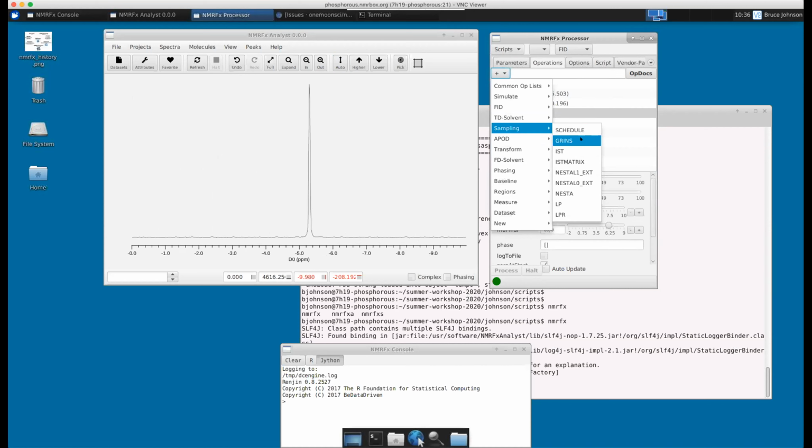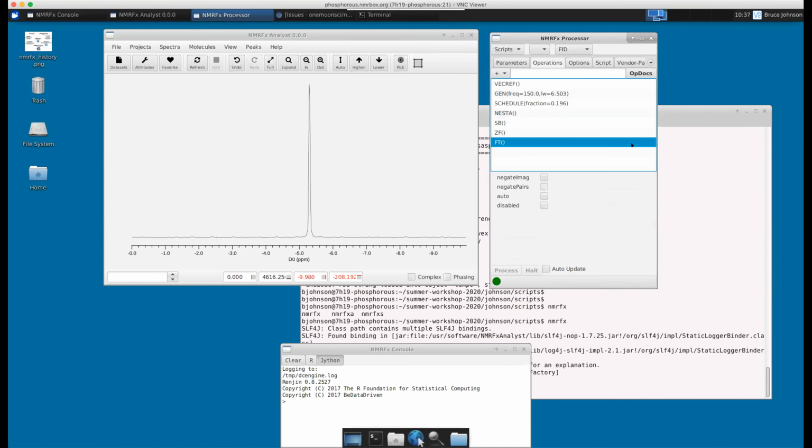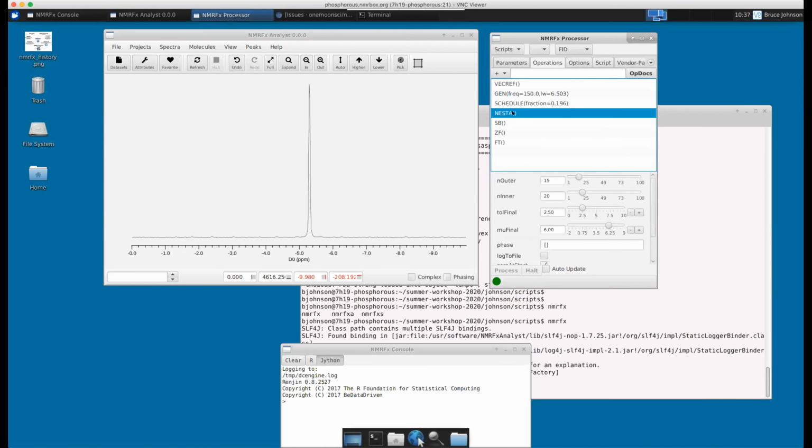Just a second. I see a raised hand. Oh, hey, Bruce. Yeah. Rajan here. So the question is, you said that the number of iterations, for example, IST or NESTA, the more iterations is going to obviously take more time. Yes. But the way you demonstrated, the time domain and reconstructed FID seemed to have happened pretty fast. Yeah. So is it reconstructing the FID, the time domain data? First question. Number two, is there some trick that you're doing where it appears almost instantaneous, notwithstanding the number of iterations?